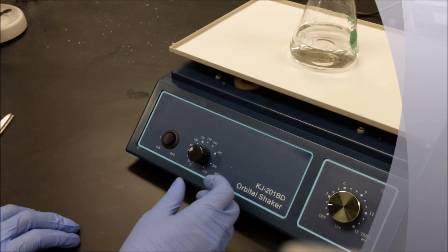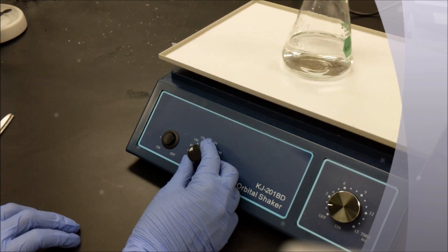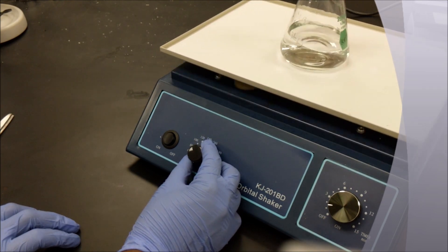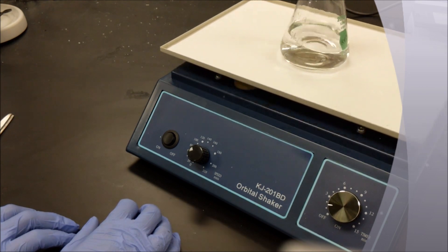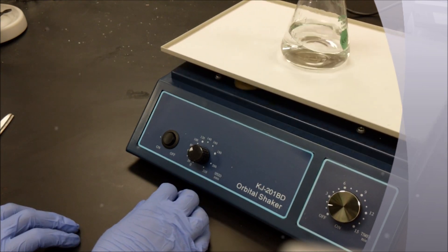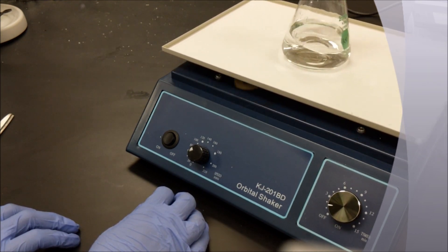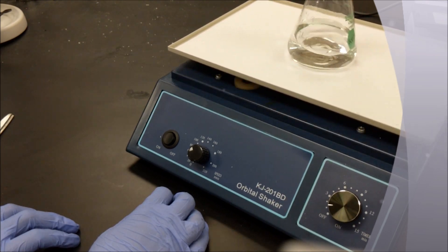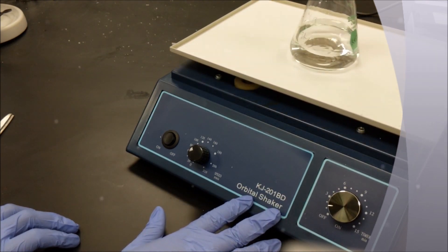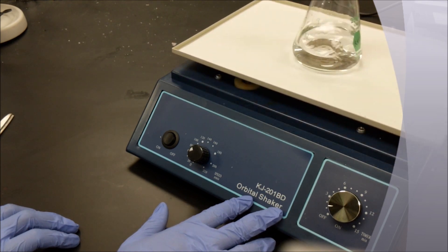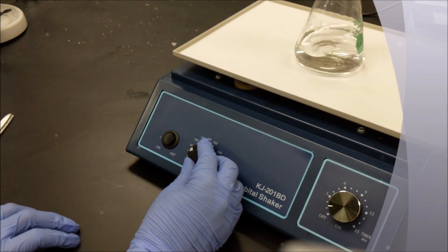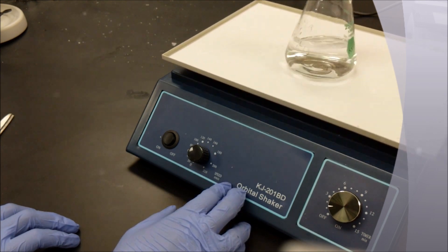go ahead and turn the revolutions per minute knob, increasing gradually and slowly until you get a relatively consistent shake of your solution on the orbital shaker platform. If you want to increase the speed, you may.